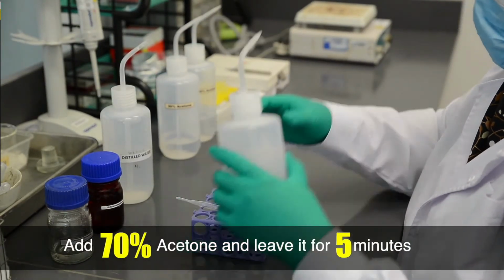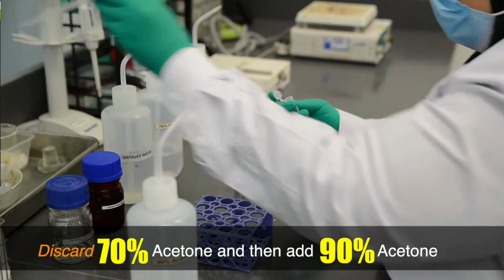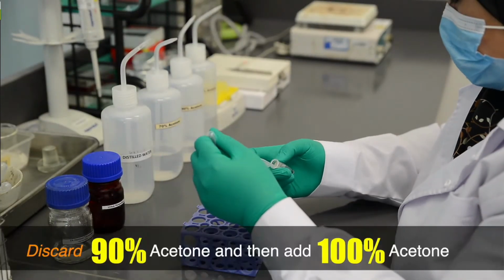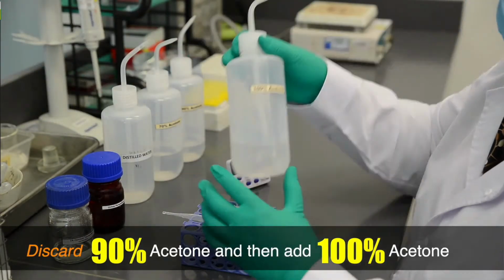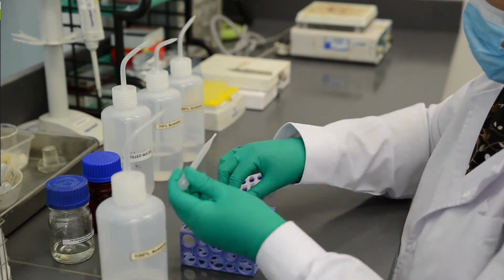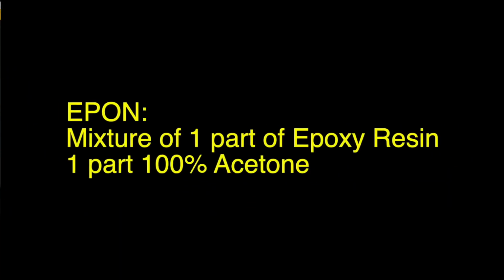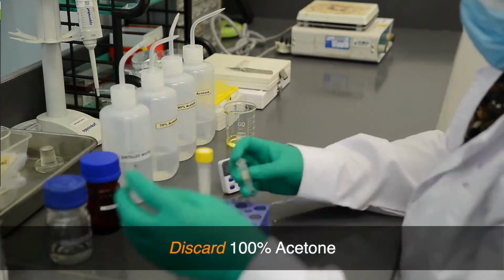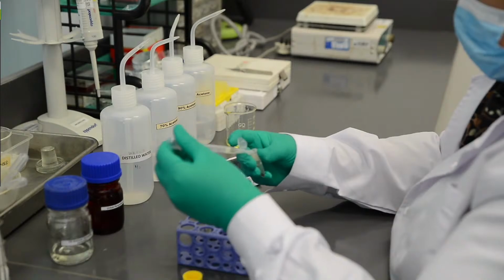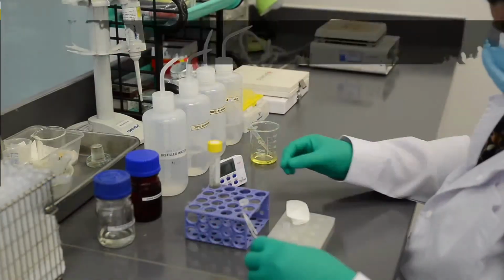And then we proceed to the dehydration process, where we start from 70% acetone, 90% acetone, and lastly 100% acetone, for 5 minutes each. And lastly, we remove the 100% acetone. We add the prepared EPON into the specimen and leave it for 1 hour at room temperature.